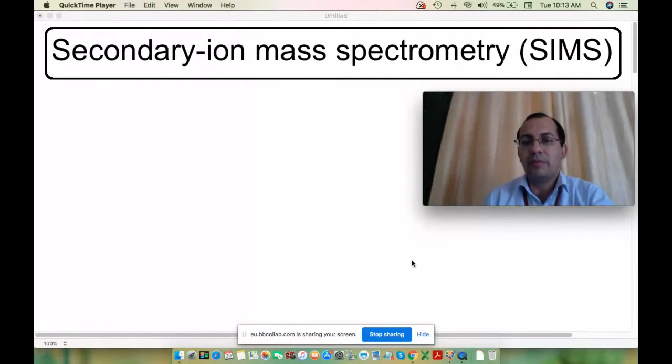Chemistry people may work at the molecular or organic molecule level, while physics people work with solid state materials, material science. In all cases, we have to see which kind of beam splitters, detectors and sources have to be used. The overall aim of FTIR spectroscopy was very clear.